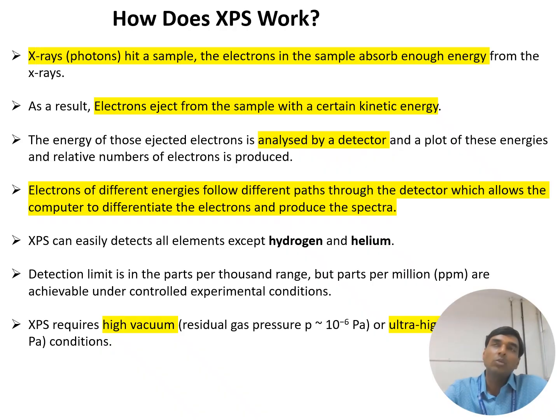One condition is that the sample has to be solid, because it has to be put in a high vacuum. That vacuum can be 10^-6 Pascal or ultra-high vacuum.